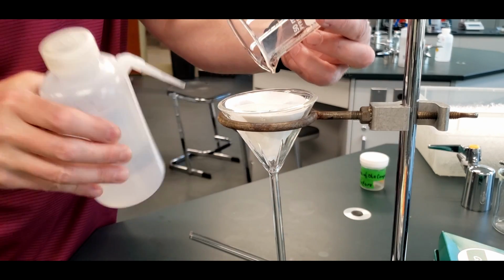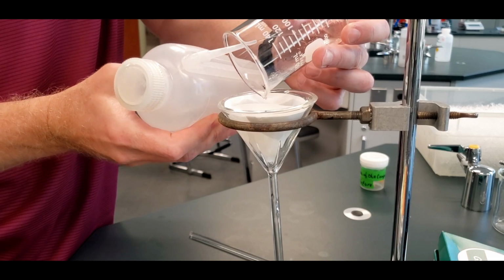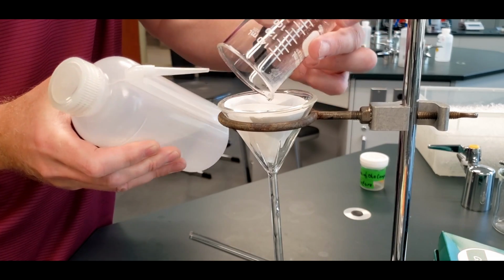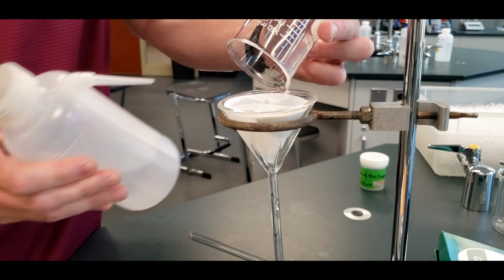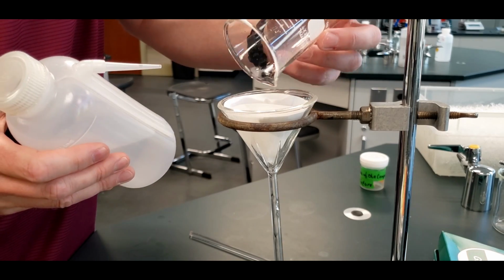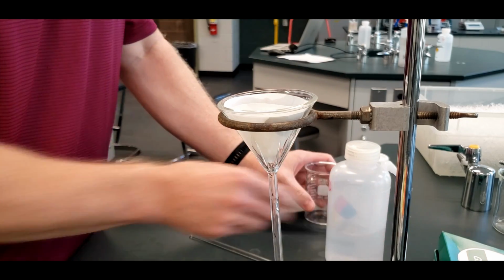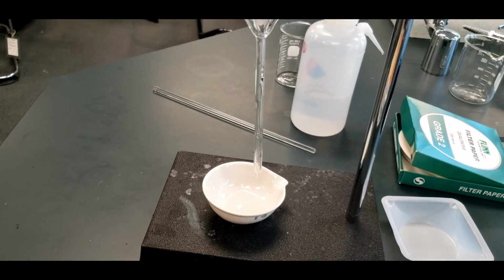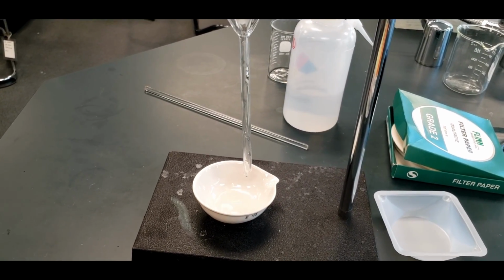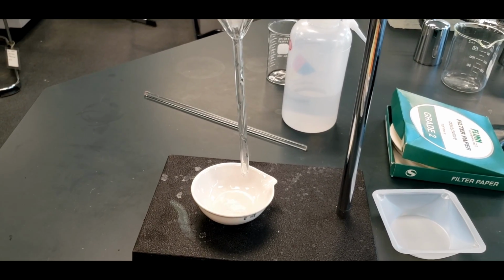And I'm going to use just a little bit. Oh man, I did not do a great job here. Okay, here we go. All right, not stellar, but I think I only add maybe 3 or 4 more mils. I see that it is dripping through, and it's going to take probably 3 or 4 minutes to do that. So we'll come back.